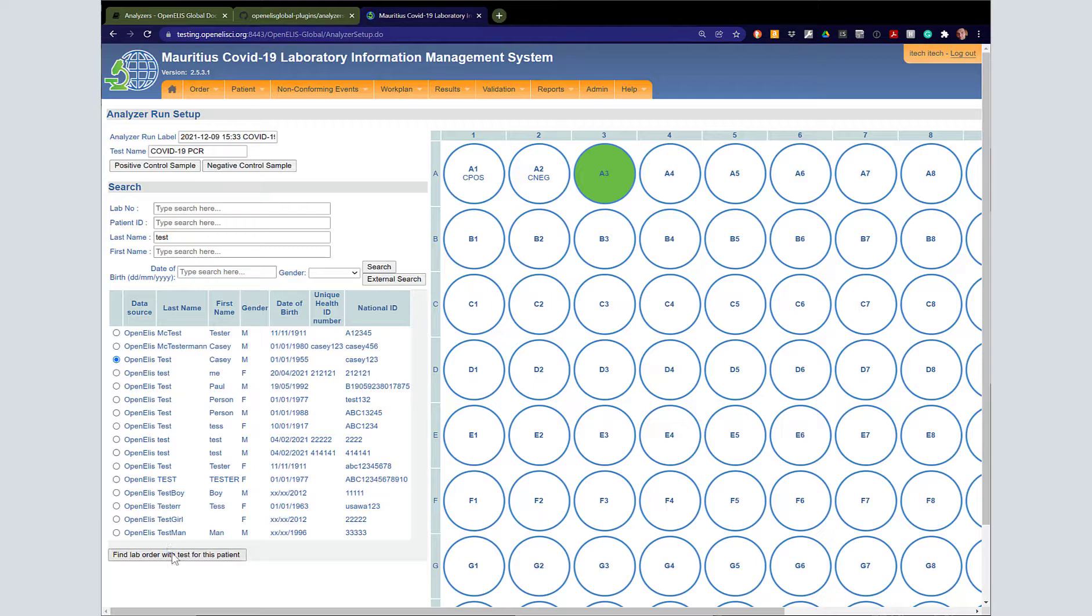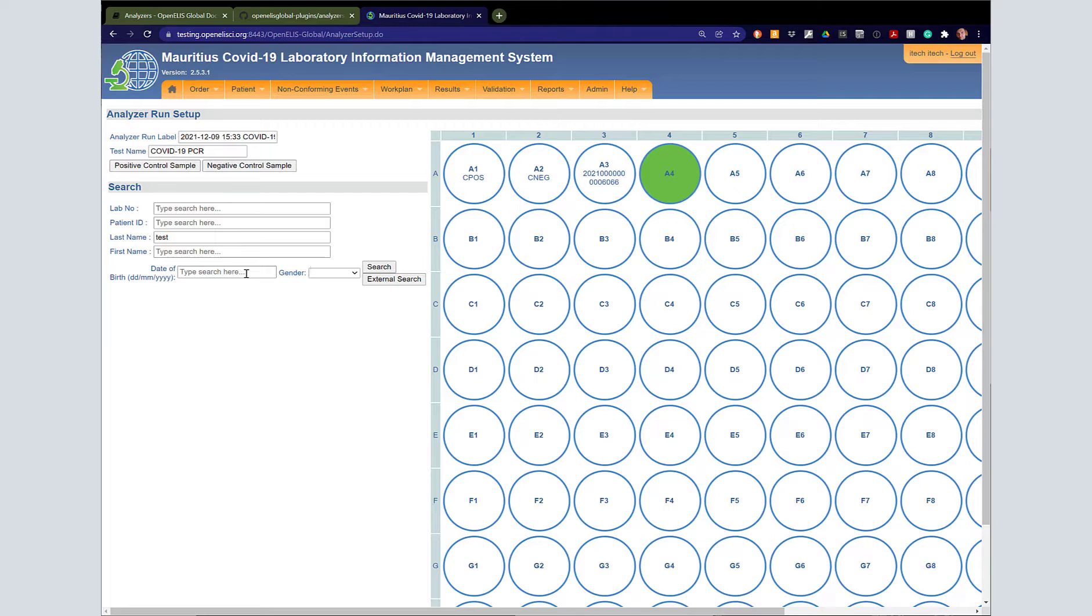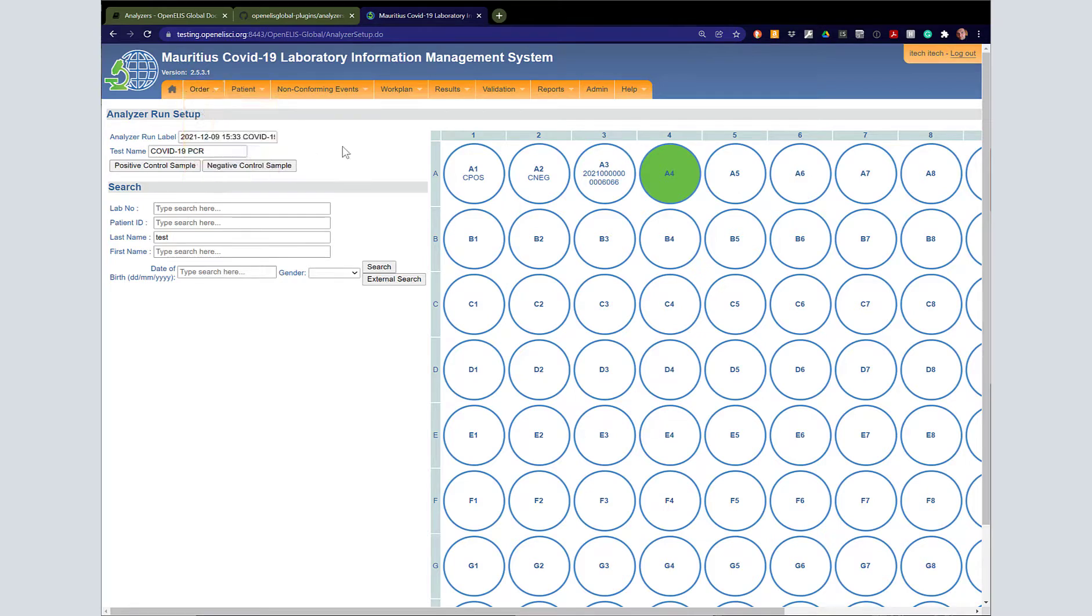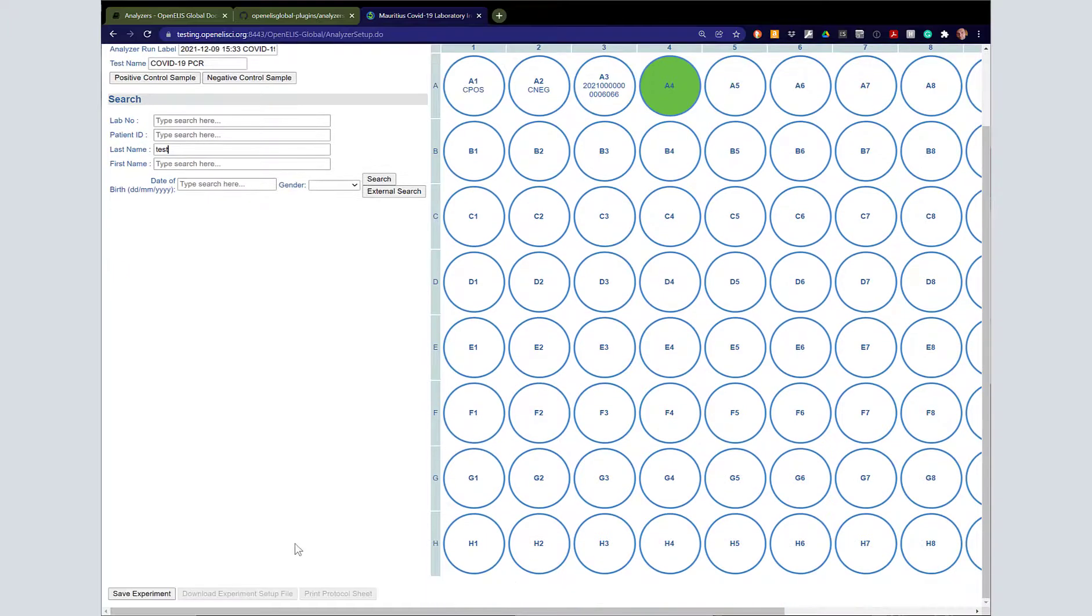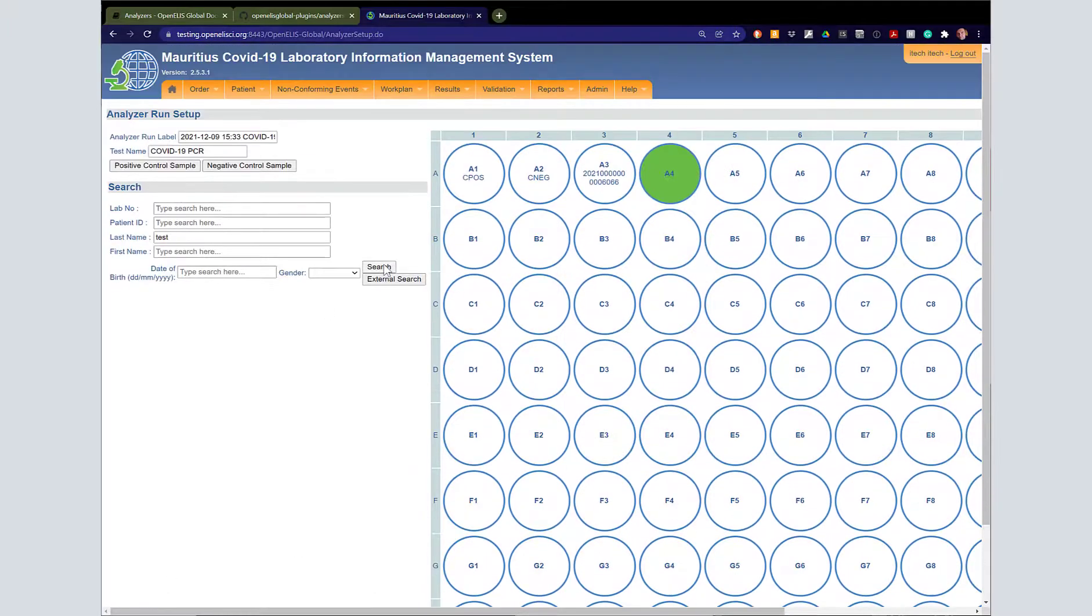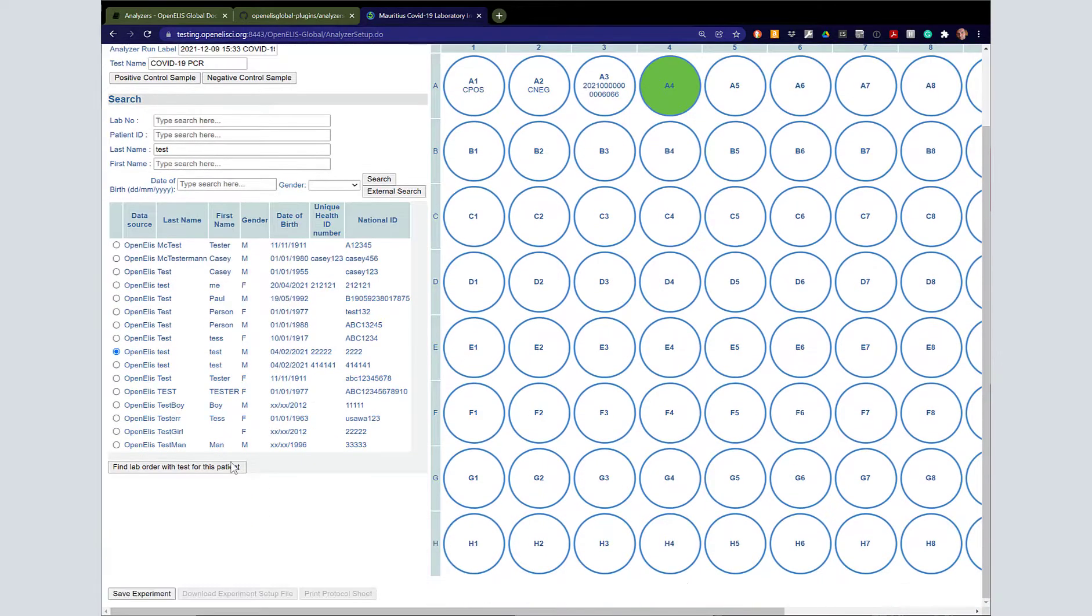If this were an actual lab, we could highlight this lab number, scan the barcode, and enter it that way. You can see here I have found one COVID-19 PCR test, and I'll just add it a second time so that we've got four of our wells configured.